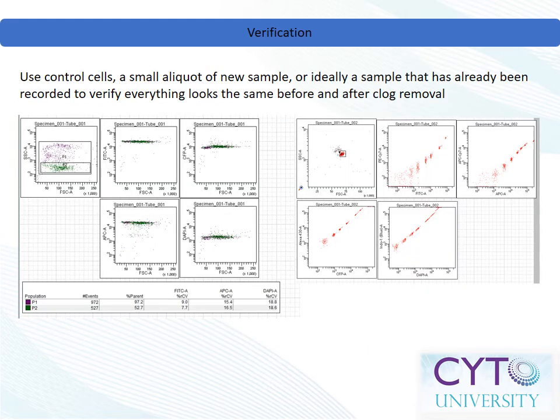As with any assay, reproducibility is key — this is true for procedures as unglamorous as clog removal. It is important to verify that the instrument has not changed in any way as a result of your intervention. Ideally, you can rerun a sample that was successfully run before the clog occurred, but in the absence of such a sample, control cells such as glutaraldehyde-fixed chicken red blood cells, leftover compensation control samples, or even quality control beads can be used to verify the instrument's performance.